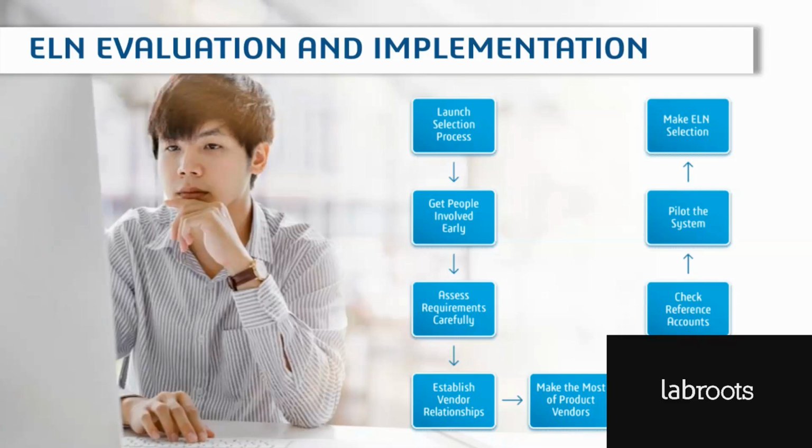I think it's also important to establish a strategic relationship with your vendor as well. So you're looking to find partners that you can work with to deploy the solutions in a collaborative manner, who are responsive to your needs, but can also help guide you based on their experience and based on best practices.